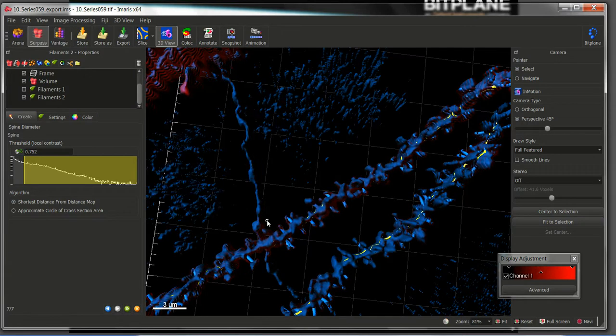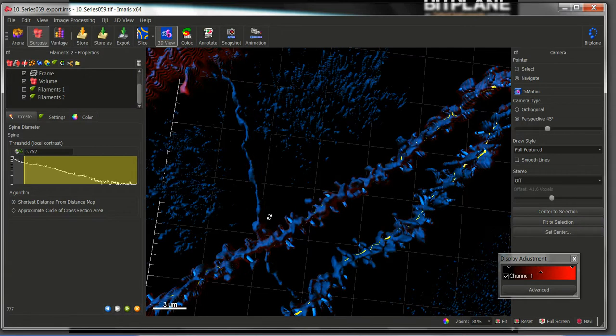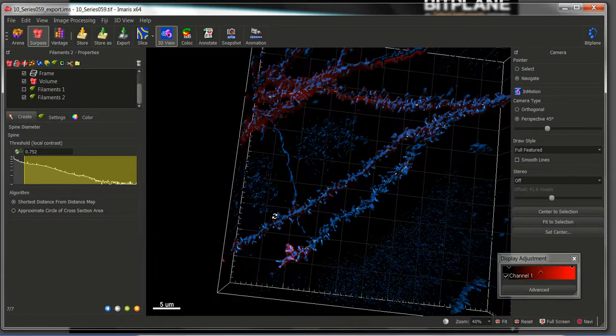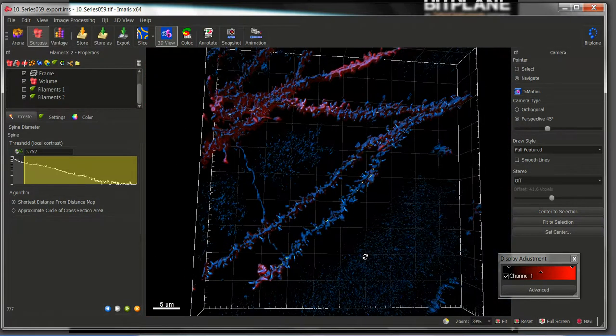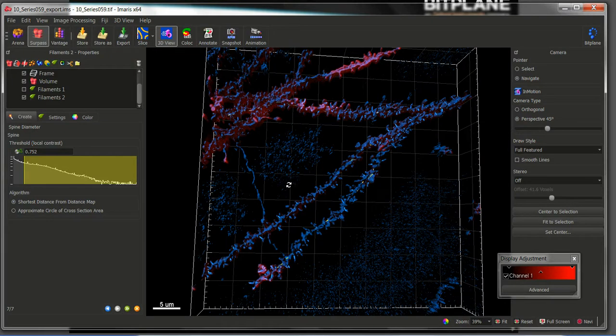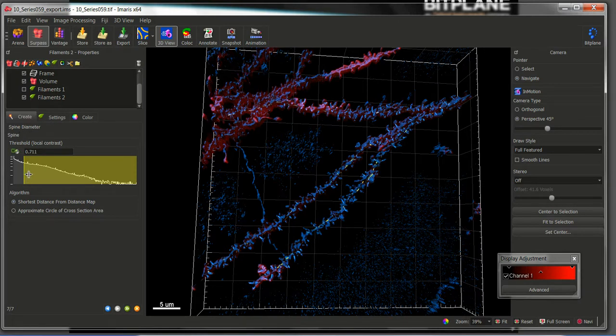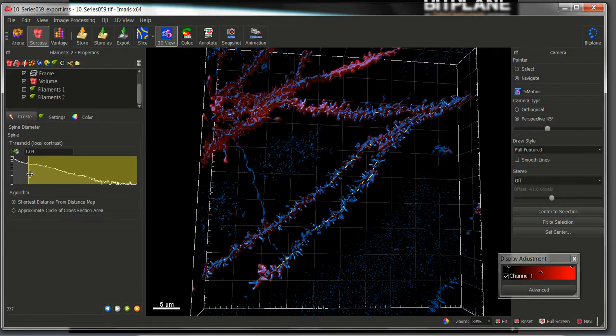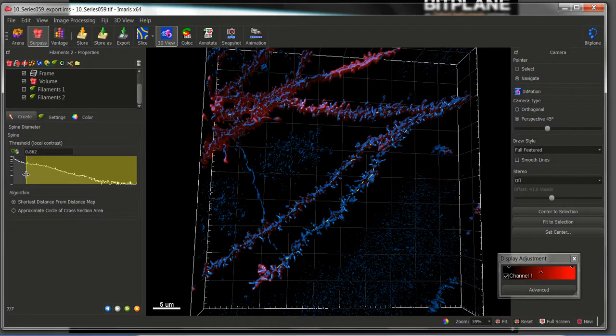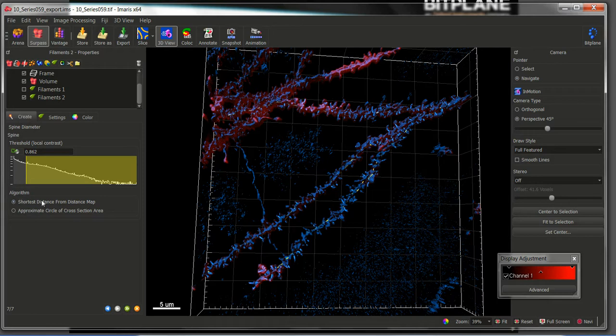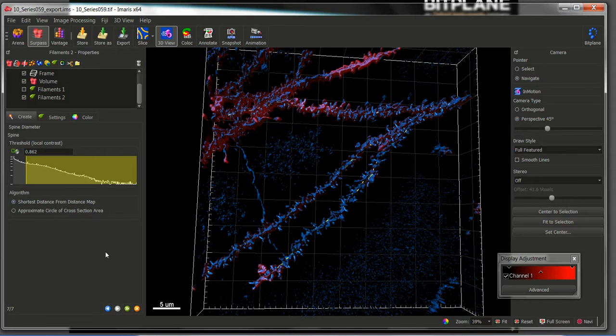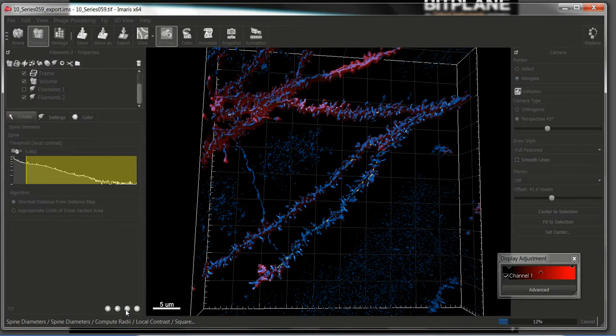And in the next step, the same that we did for the calculation of the diameter of the dendrites in the previous step, now we come into the step where we have to quantify the diameter of the spines. For that, again, we will adjust the thresholds to the right intensity signals and choose the algorithm that will be used to quantify the diameter for the spines. In this case, I will choose the shortest distance from the distance map. Since there are no more next steps, let's finish the algorithm.